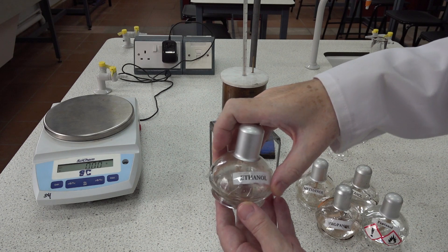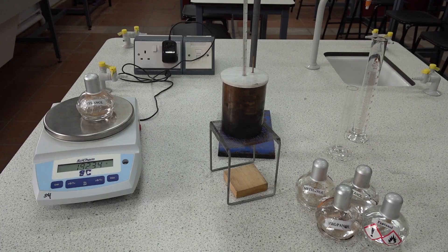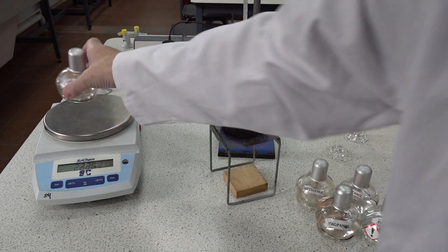We then weigh the spirit burner. This one is 192.34 grams.